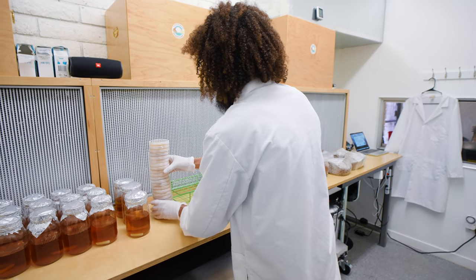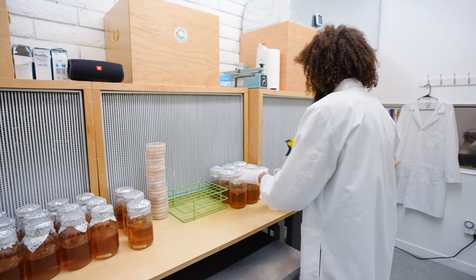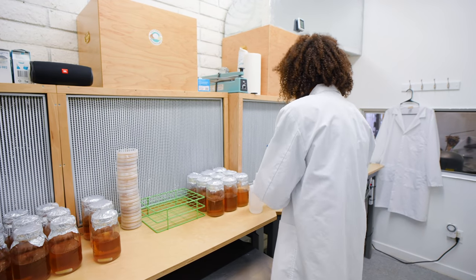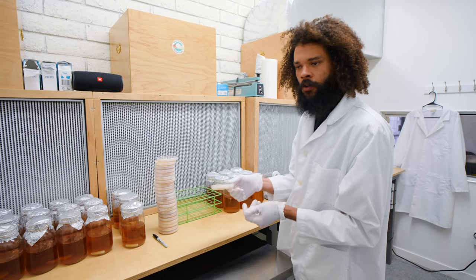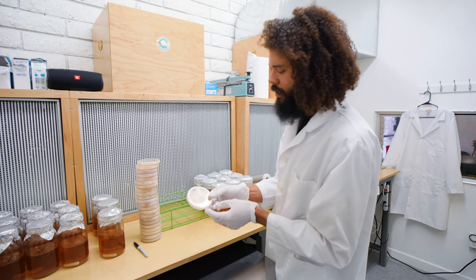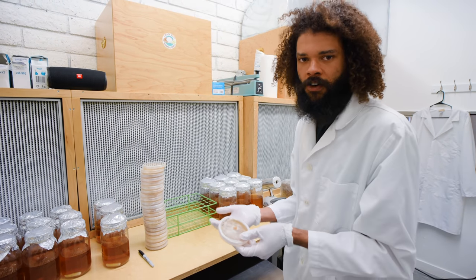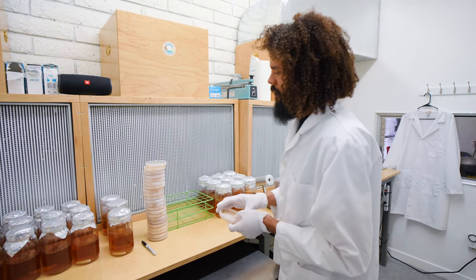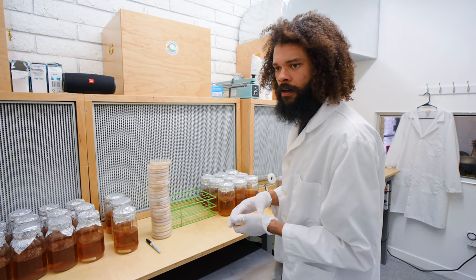I just have a stack of petri plates — every one is its own strain or species that I want to propagate and grow out throughout the liquid culture. We have an HE0, which is a lion's mane — that stands for Hericium erinaceus. We actually have four lion's mane strains that we're going to grow out today.